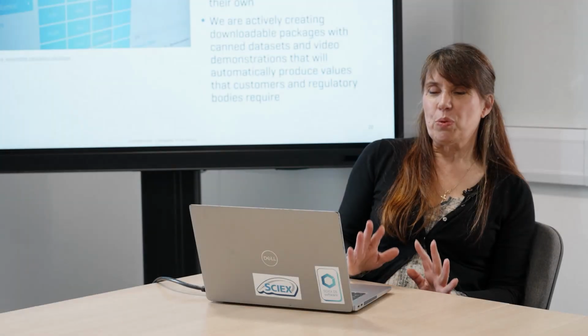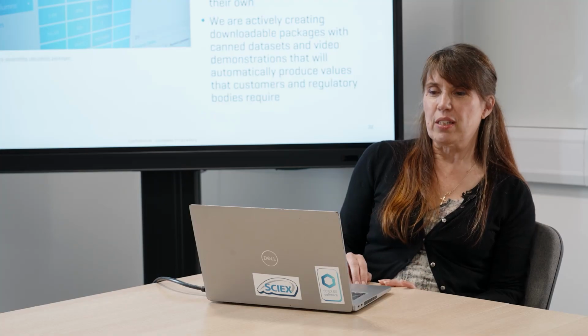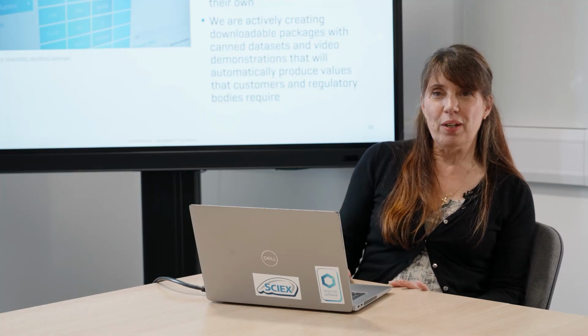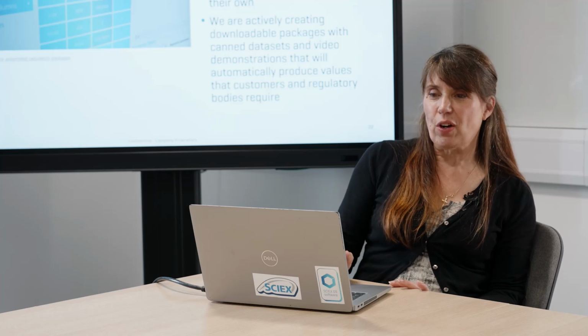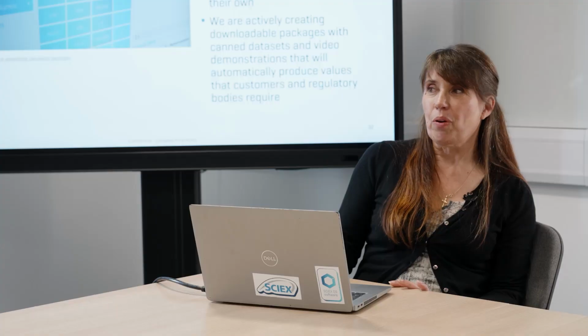So we've just learnt what's in SCIEX OS that can help us with these calculations from ICH M10. So what you can do is go to our website and find these calculation packs. And what we're going to do now is go through what's in the pack and how to unpack them.